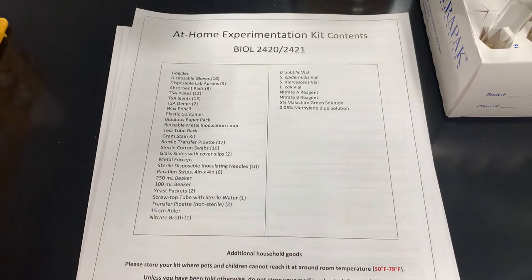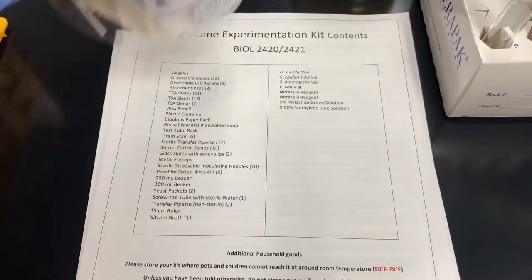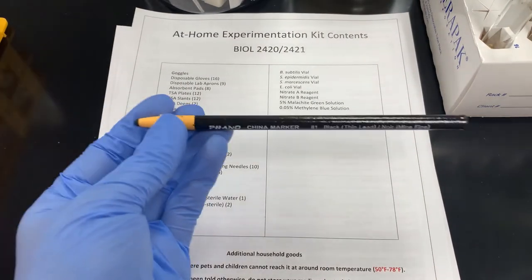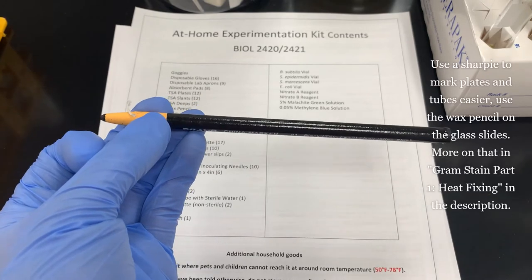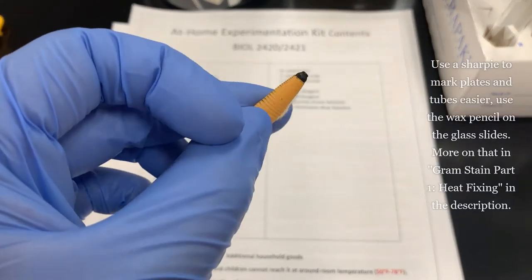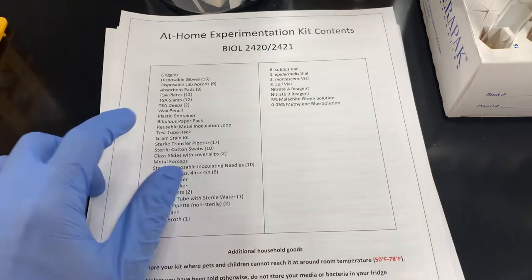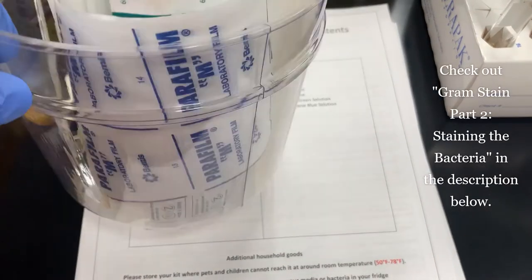Wax pencil. Now you're going to find a bunch of these items come in this plastic tub, okay? Nice little gift basket for you. Got a wax pencil. This is for marking plates and tubes and microscope slides, okay? Just use scissors to trim the top of that off. That's paper that's going to come off real easily. Next we have the plastic container itself. You're going to use this for gram stain, okay?